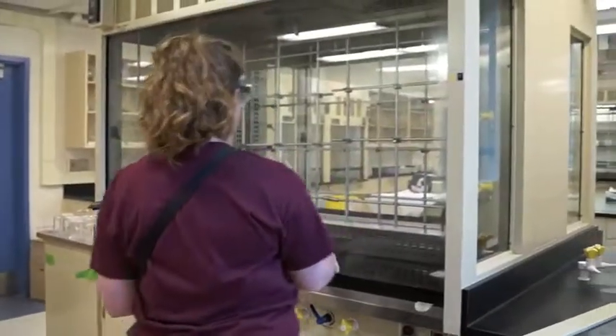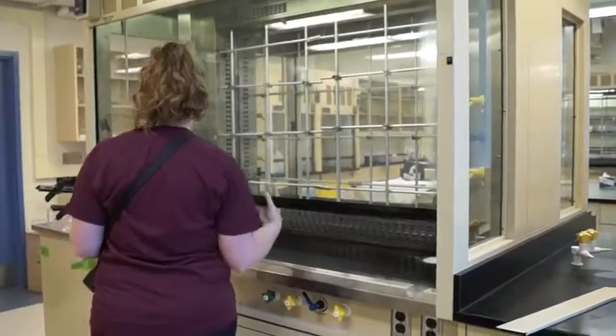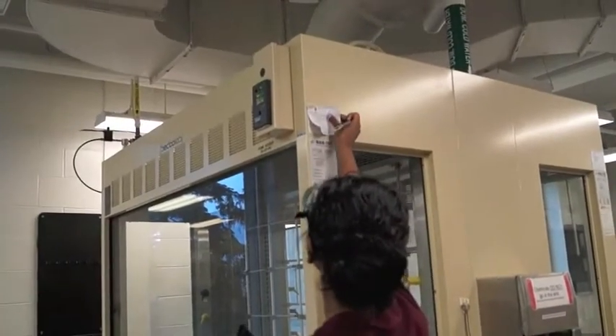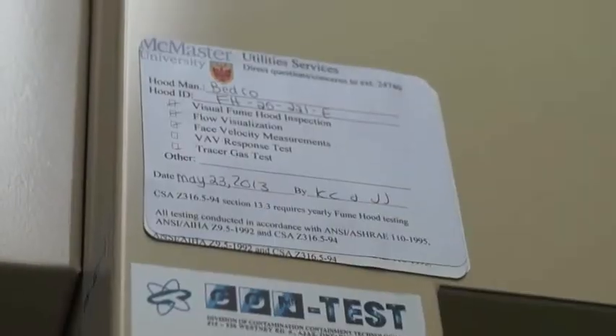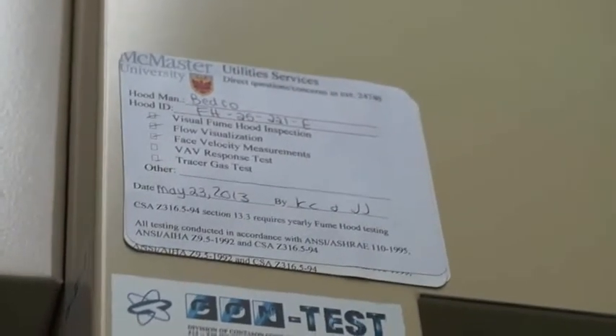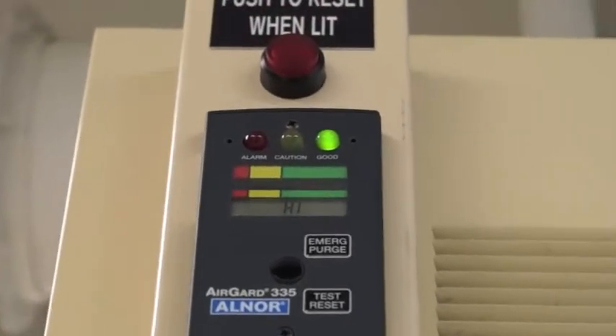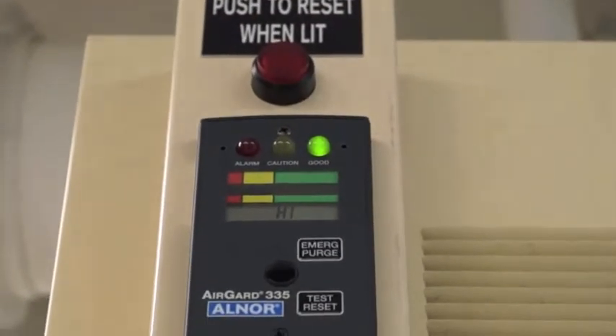Lastly, when you are using the fume hood, you should turn on the hood light so that you can see clearly. Check the hood certification sticker completed by McMaster that shows the last average inflow check and whether the airflow is satisfactory.